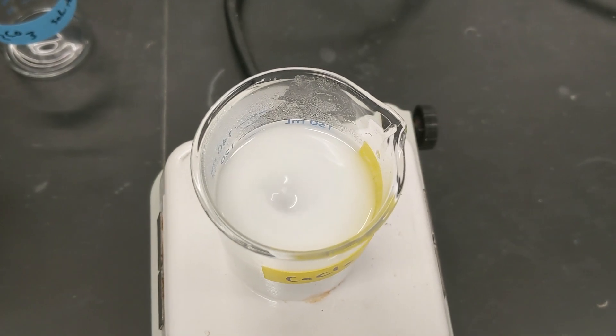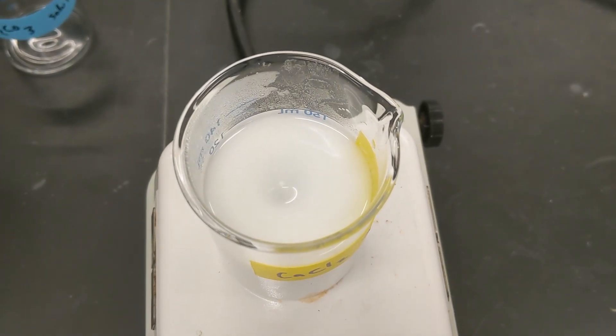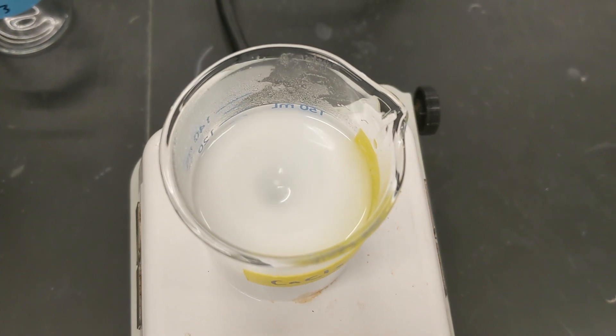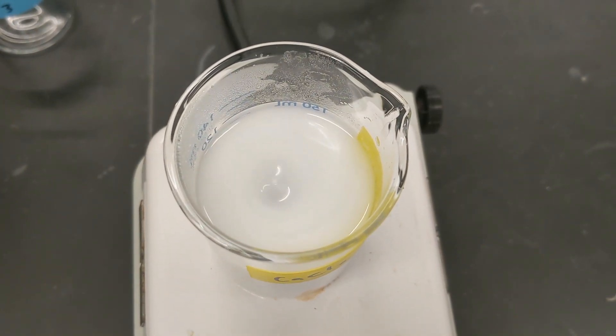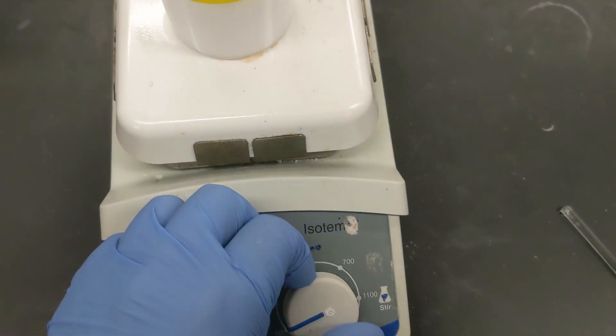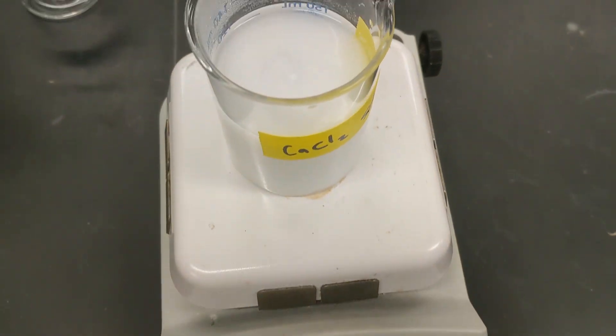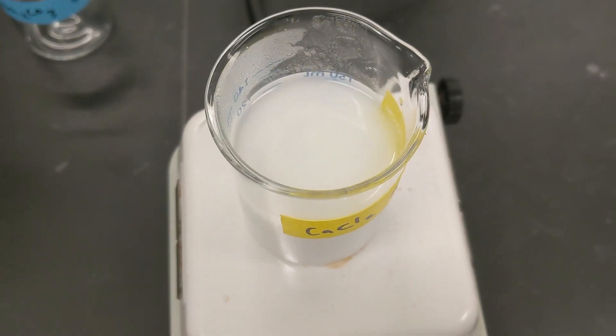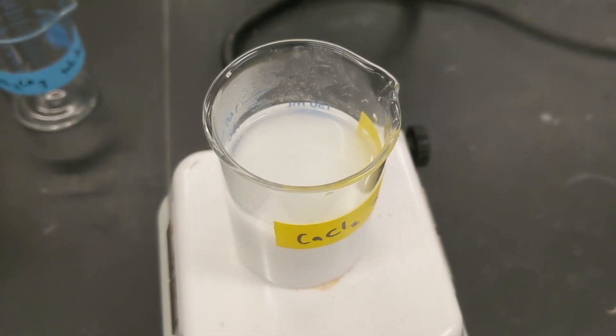So it's been about two minutes and we can see that it's still stirring and it has that white precipitant formed. So now I'm going to turn off the stirring to allow the precipitant to settle to the bottom of the beaker before we start filtering.